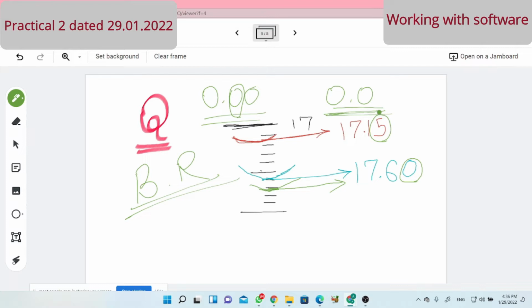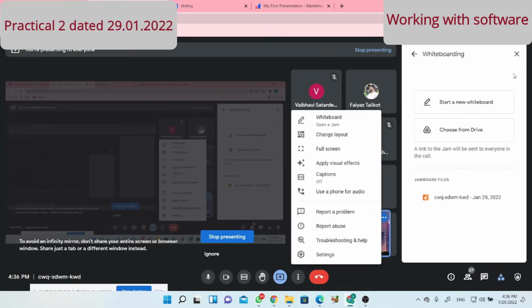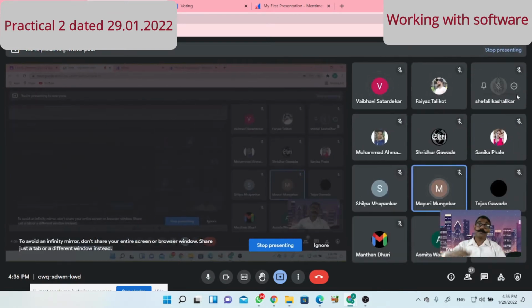Why? Because generally burettes are tall. Students, are you understanding what I am saying? Could you pay attention? Yes, sir. And burettes are tall. So for 50 cubic centimeter, considerable height remains. When a student comes, students also stand. But the height at the 0 level considerably remains up.